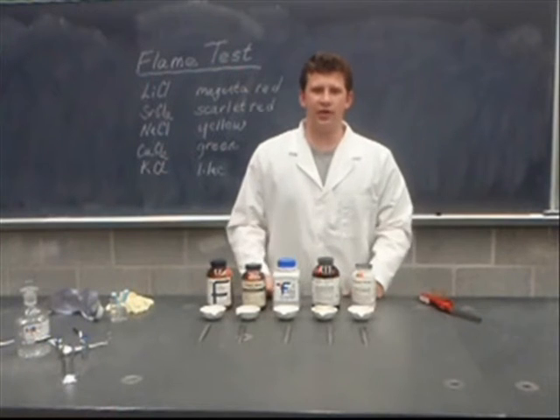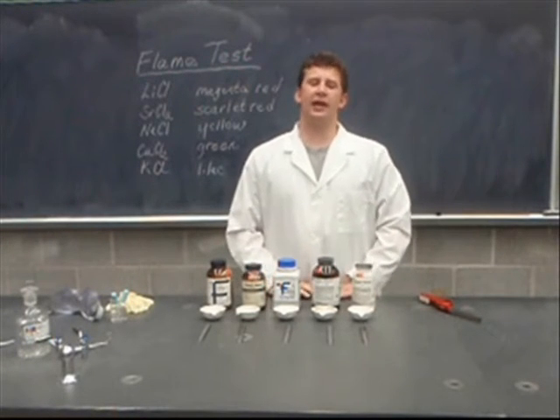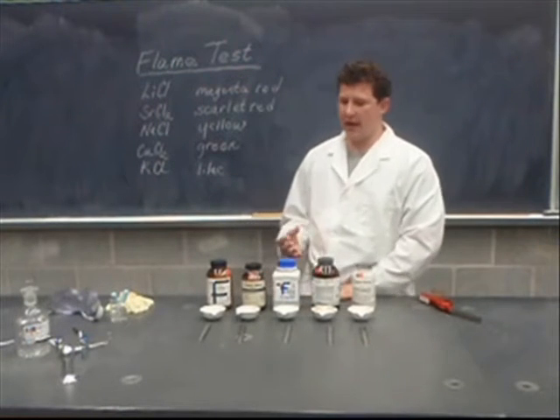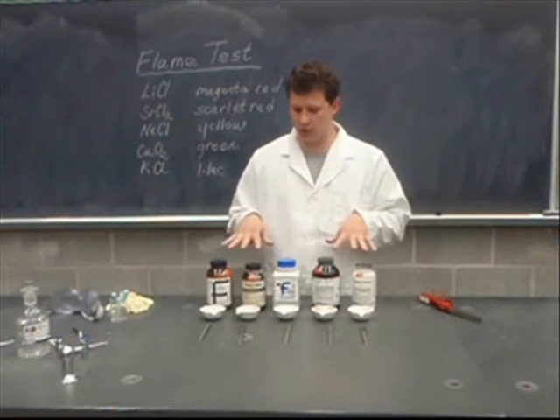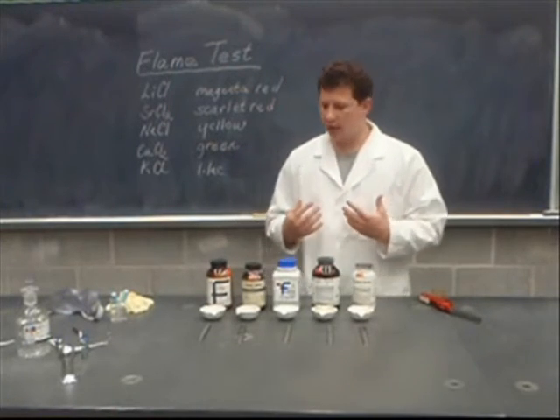Hello class, today we are going to be discussing the flame test. The flame test is a method to detect unknown metals. Today what we're going to do is use these known metals. You burn them in a gas and they're going to produce a color.